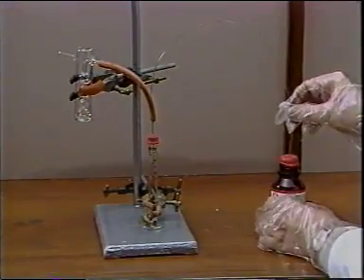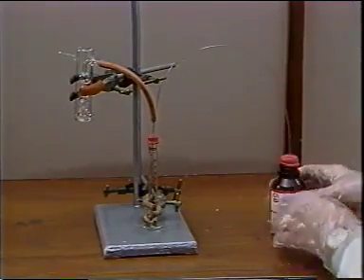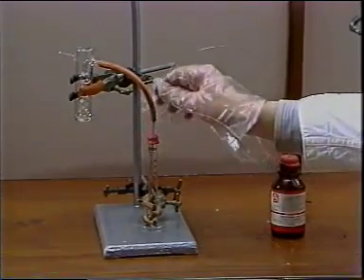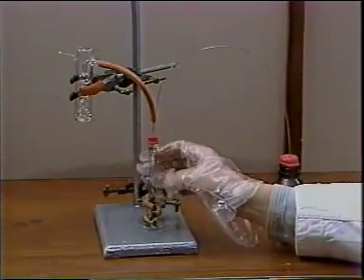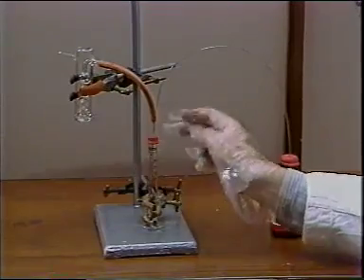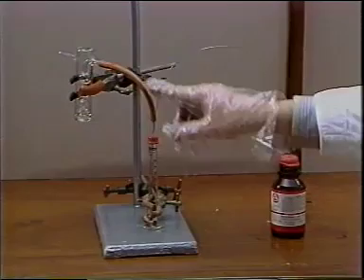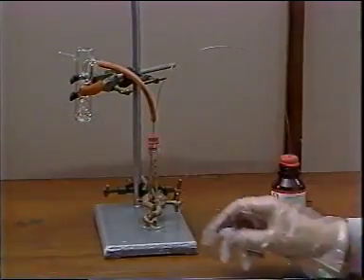One end is inserted through a septum down below the level of the reagent solution, and the other end through another septum into this measuring cylinder, which we're using as a vessel in which we can measure the amount of solution we require. This septum also has a nitrogen escape leak, again through one of these oil bubblers.